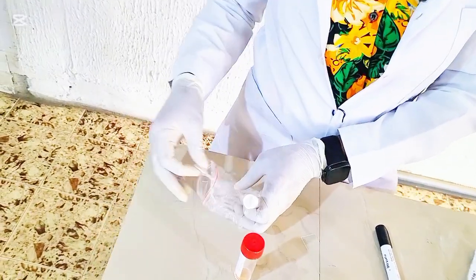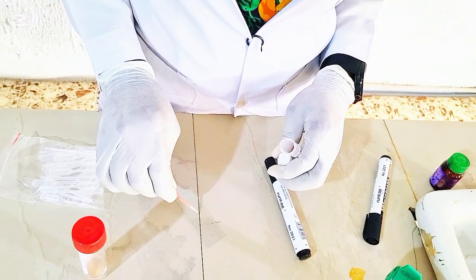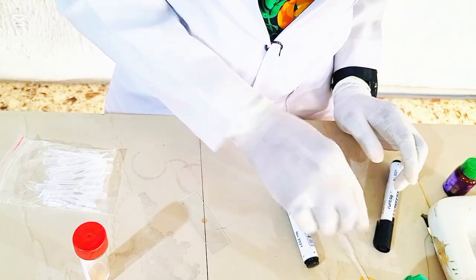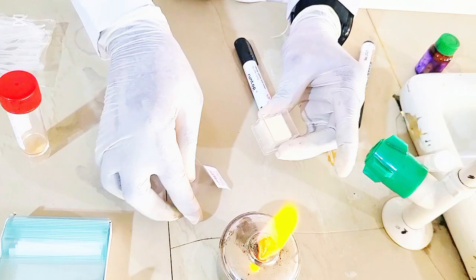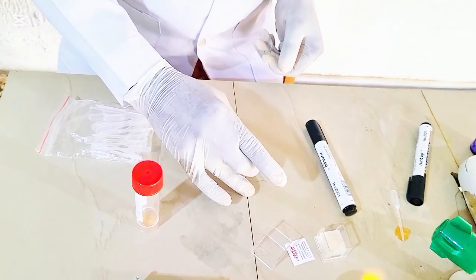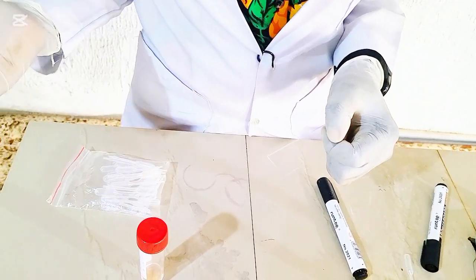You put a drop of the sediment now on your clean grease-free slide. Then we'll cover with our cover slip. And then we'll view using the ×40 objective lens.